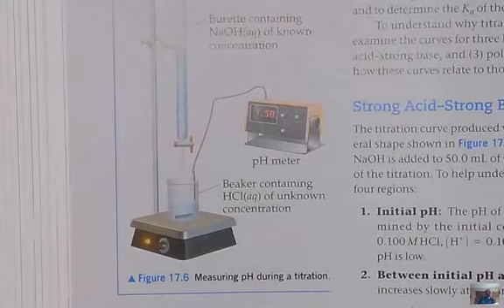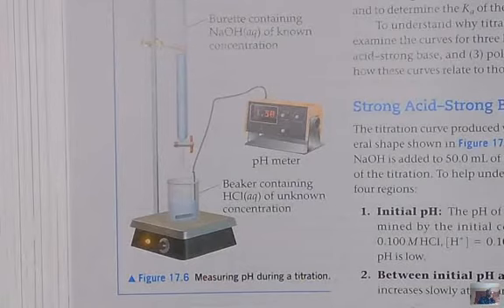This is the second video for Chapter 17. This video is going to concentrate on one topic, and that is titrations. I'm going to show you the setup first, and then we're going to talk about the different kinds of titrations that you can do, what you should expect, and the calculations that go with them.